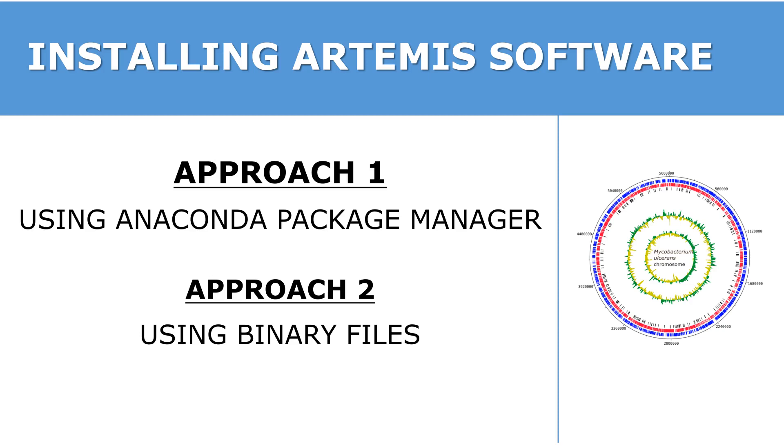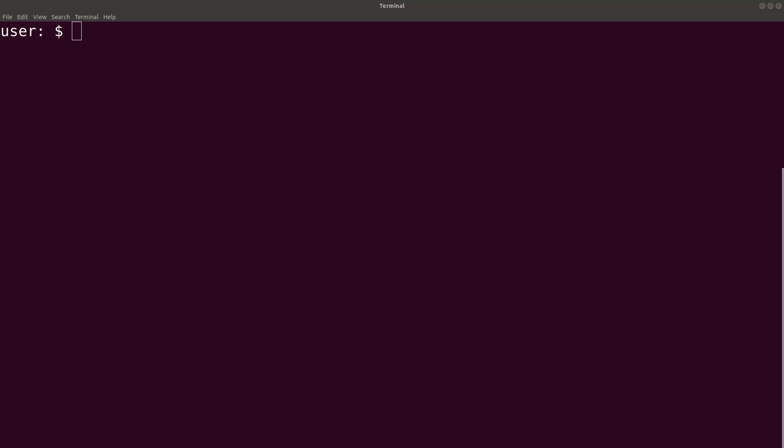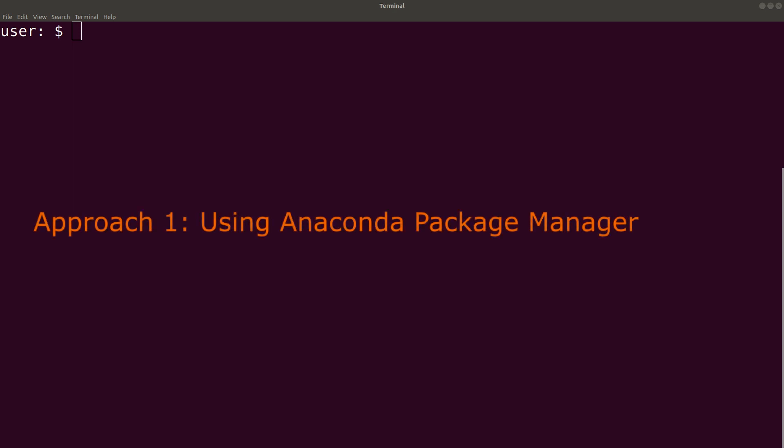In this tutorial, I am going to show you how you can install the Artemis software in Ubuntu. The first approach is to use the Anaconda Package Manager to do the installation.